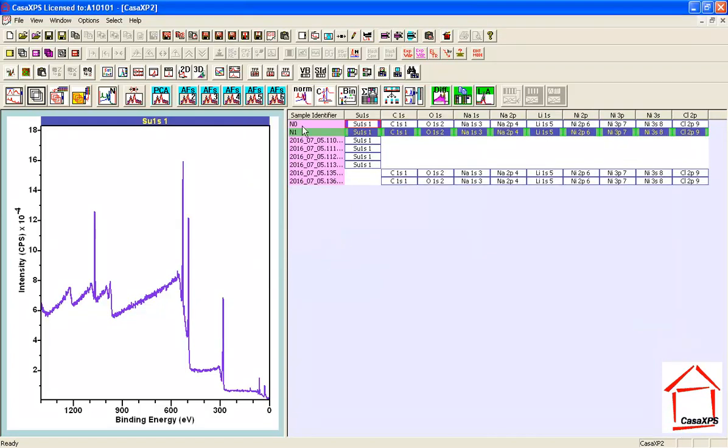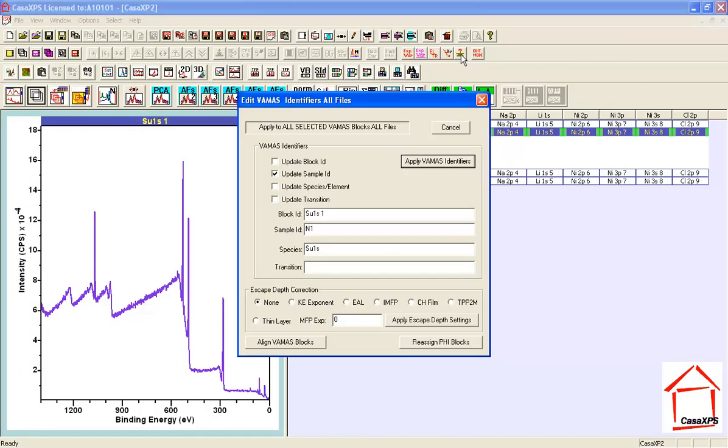So to align all these survey spectra with the high-resolution data, you just simply need to go through and make these adjustments using the toolbar button and the dialog window.